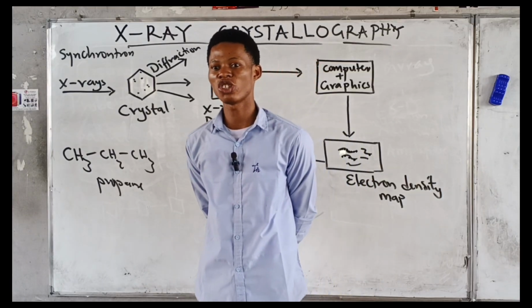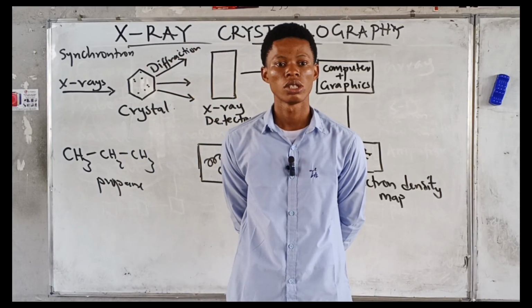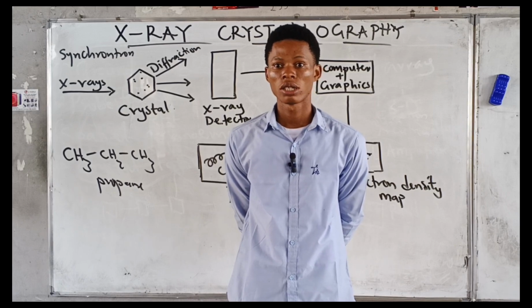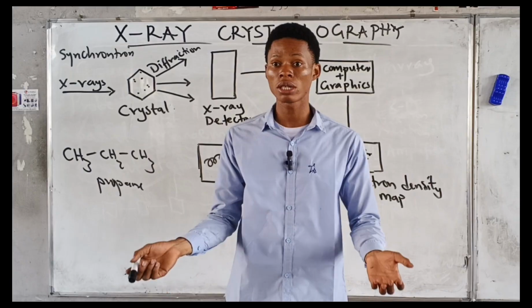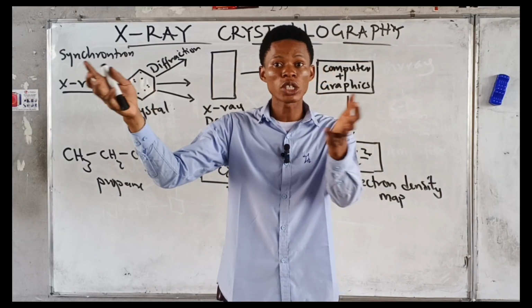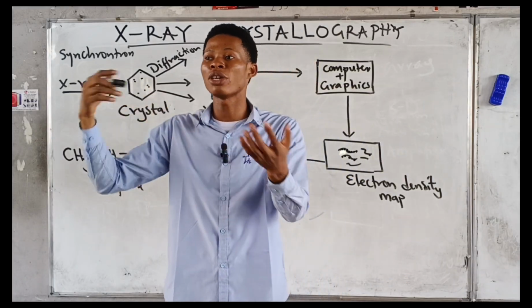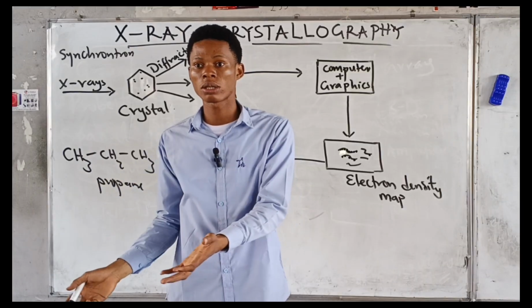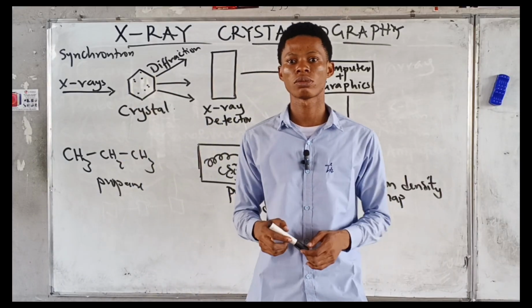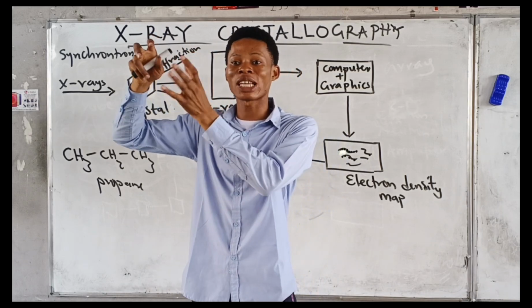Now, it can also be used in geology. Who can tell me how X-ray crystallography can be used in geology? Geology, we are studying what? Okay, it's soil, rock, the study of the earth. Geo means earth, is it not? Geography, description of the earth. Yes. Geology, logy, study of the earth. But now we're looking at maybe solid soil, rocks, and the rest. So what can you use X-ray crystallography for? You can still use it to probe into the spatial arrangement of those crystals, rocks.